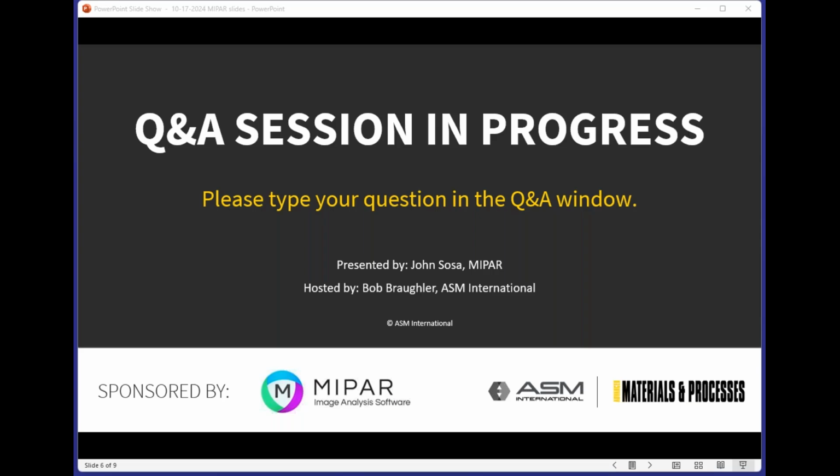Okay, digging into some more specific questions then, and this first one came in about 15 minutes into your presentation. The question is, for the Spotlight segmentation, is there headless / API access? In other words, can it be run programmatically by an external script?